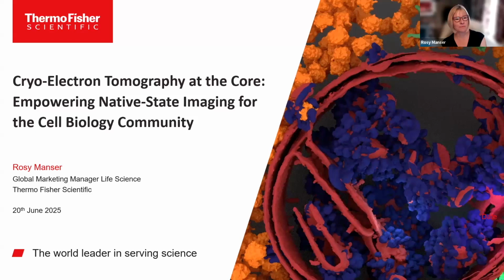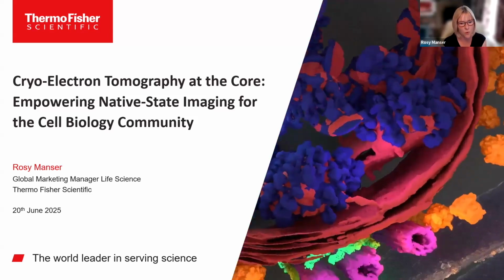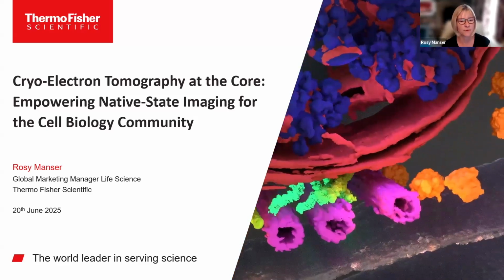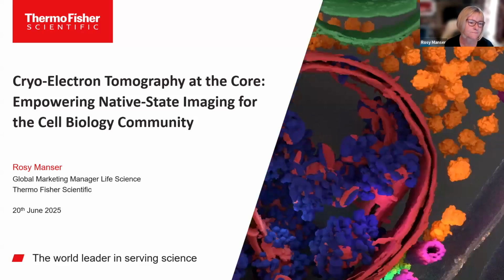So yes, thanks. I'm going to be talking about cryo-electron tomography today. And as Claudia said, my microscopy history began on the light microscope side of things. My passion really is around how many of these different microscopy techniques can fit together to address different scientific questions. And cryo-electron tomography is one of those aspects, which is a really growing area for being able to answer questions at a different length scale in biology.